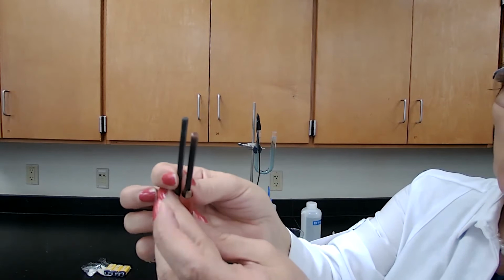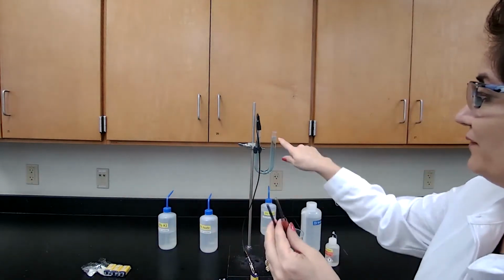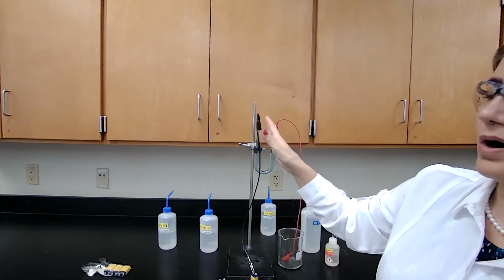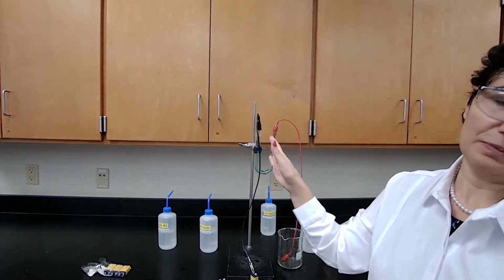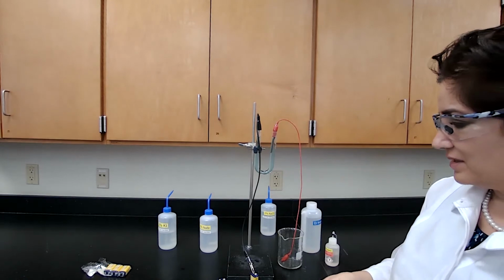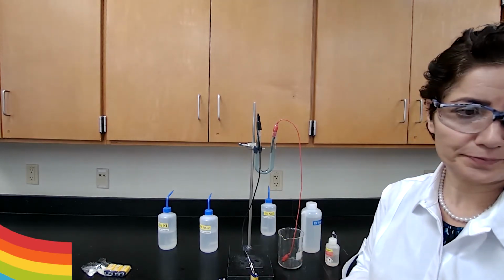Okay, so copper has been reduced, and we know water is not reduced because we did not see the pink color of phenolphthalein. So water is the only choice for oxidation at this point. Water has been oxidized because water is not reduced and copper is reduced. That's the end of this reaction.